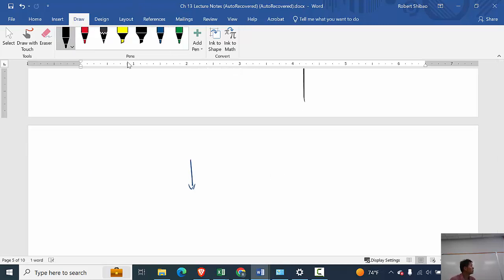So here we're going to cool to room temperature. About room temperature. It could still be a little bit warm. And then we're going to add 10 milliliters of 95% ethanol. Ethanol is abbreviated ETOH, ethyl alcohol or ethanol, 10 milliliters. It says with stirring. I don't normally stir it.